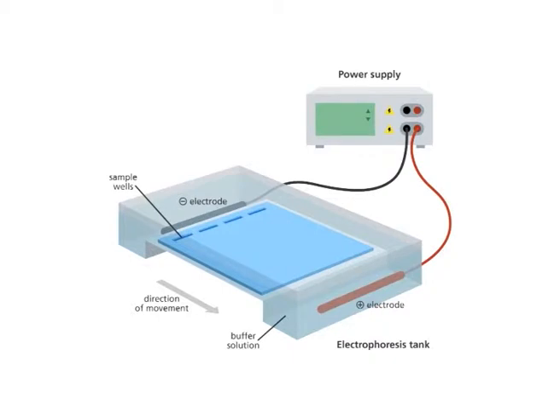Electrophoresis takes place because the particles dispersed in a fluid nearly at all times carry an electric surface charge. The charged molecules migrate to the oppositely charged electrodes, but the electric field is removed before they reach there completely. Passage of charged particles in an electric field provides differential motion to the sample on the basis of charge and consequently resolves them. An electric field exerts an electrostatic coulombic force on the particles through these charges.